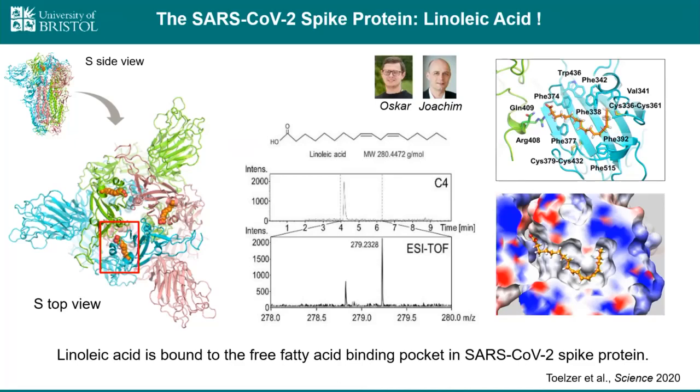We can nicely use these for fluorescence imaging to see whether these particles, which are not replicating, obviously, because they are entirely synthetic, bind on the surface of these Vero E6 epithelial cells, and we can quantify this. We have normalized it against native spike, that's our spike from insect cells, which contains about 70% linoleic acid bound spike proteins. If we remove that and have the apo spike, which is not linoleic acid bound, you see a better retention of these SUVs, or mini virions, on the surfaces.